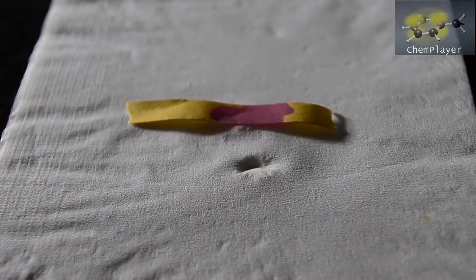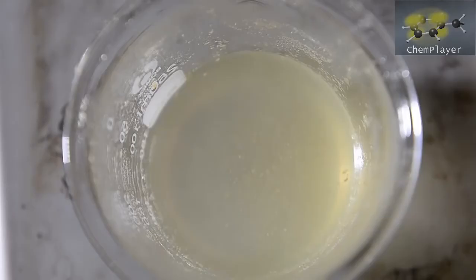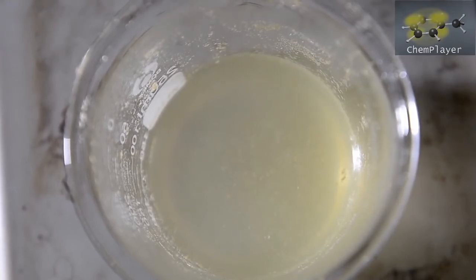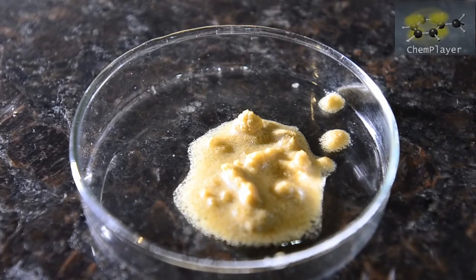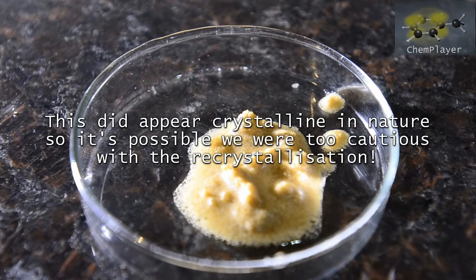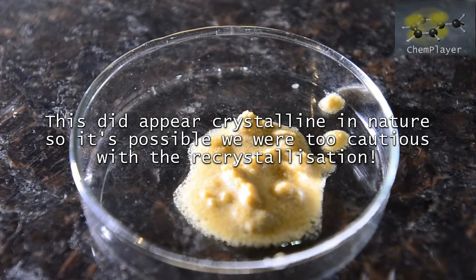Strongly acidic. We removed any remaining brown fluff from the surface so the mixture was nice and clean. We're not too sure what this is. Perhaps it's simply excess potassium benzilate and we were overcautious with the recrystallization, or perhaps it's a byproduct. We'll have to do some more research to find out exactly.